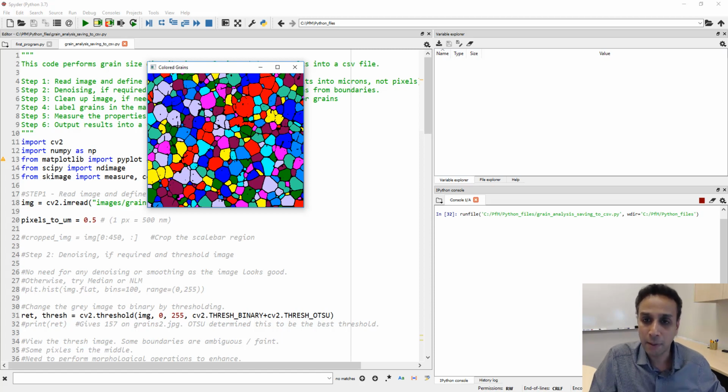The best example would be these two grains, right? Keep an eye on it and look at the grain boundary. It almost looks very porous. What that means is there are certain pixels that are connecting this grain with the other grain. So the program actually thinks that, hey, this is one grain. There is no well-defined boundary between these two. This is a big problem now.